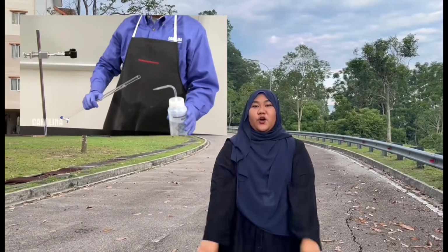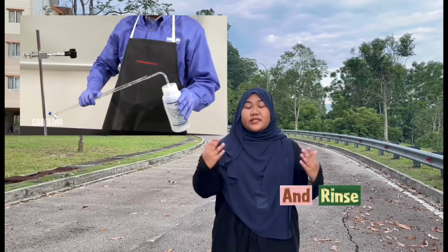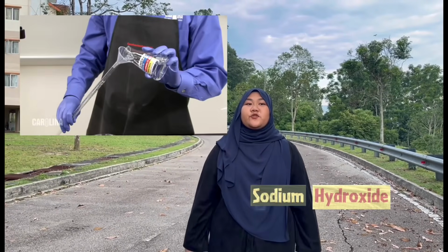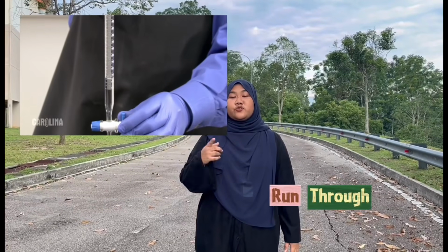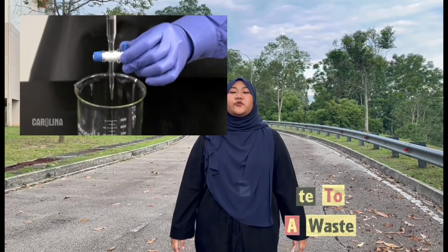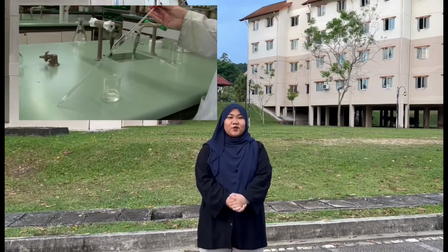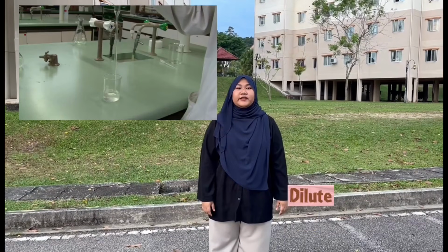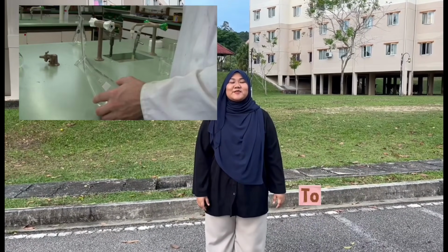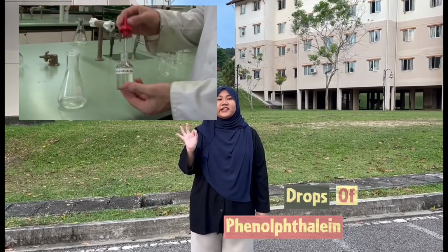Next, rinse the pipette with distilled water and rinse again with the lemon juice solution, and rinse the burette with sodium hydroxide solution, letting the solution run through the burette into a waste beaker. Complete this action 3 times. Now, using a pipette, transfer 20 ml of diluted lemon juice to a clean conical flask and then add 3 drops of phenolphthalein indicator.